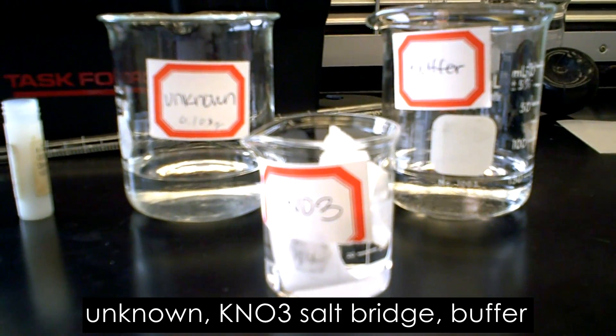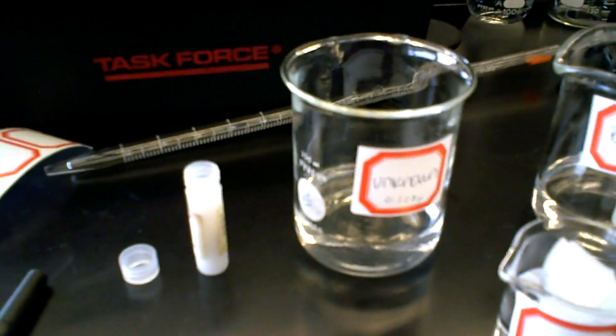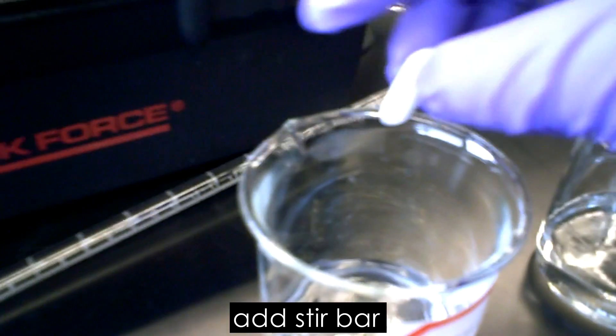Create a salt bridge from filter paper and soak it in potassium nitrate solution, as you'll use it to connect the unknown and the buffer. Then add a stir bar to the unknown solution beaker.